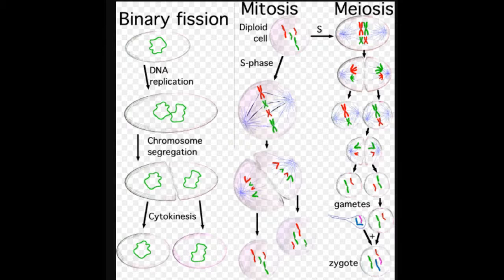Bacteria reproduce asexually, which means that they divide in half and make two identical bacterial cells. However, they're still able to share genetic information. One way they do this is via small circular pieces of DNA called plasmids. Today you will be able to introduce a plasmid into bacteria that will give them new abilities.